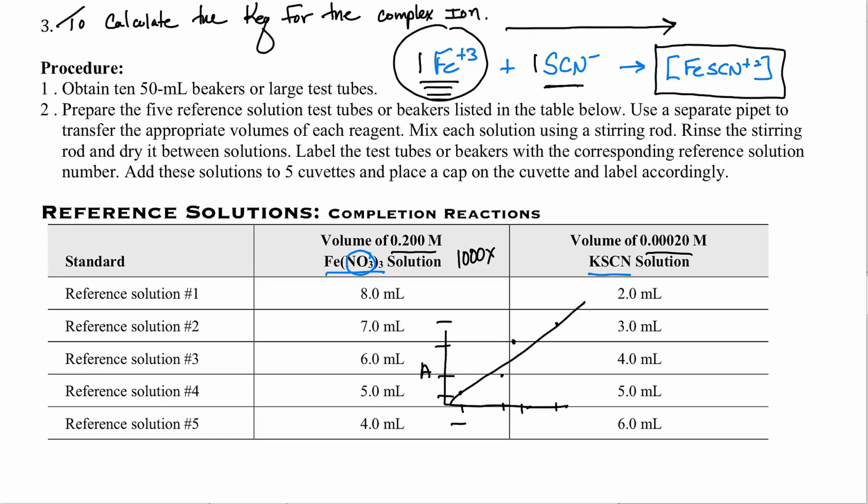And we're going to use that to solve for the equilibrium values. But in order for me to use spectrophotometry, I've got to set up a reference graph, a Beer's law graph. So this is very important to understand. Remember, this reaction is essentially going to completion due to Le Châtelier's principle. So as much of the thiocyanate ion as I have, we're going to drive that to essentially 0. That's exactly how much we're going to make.